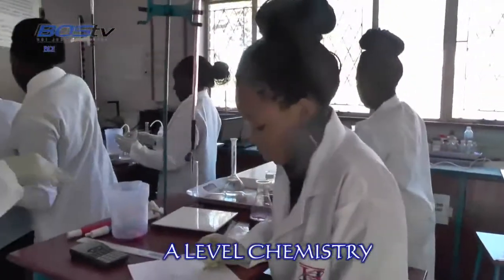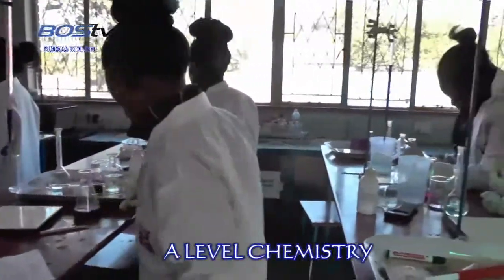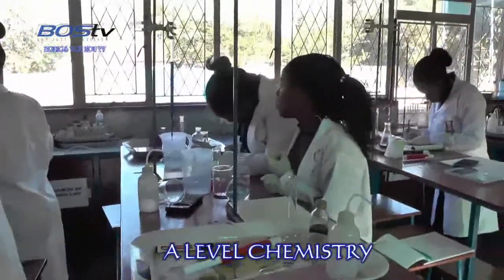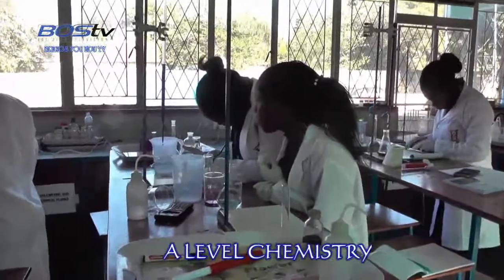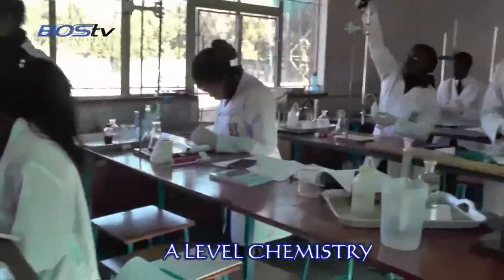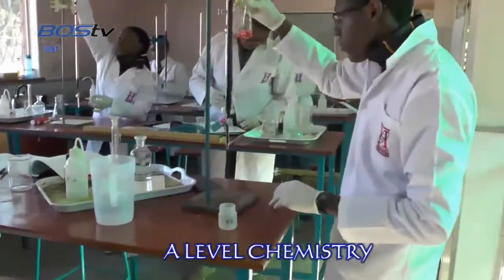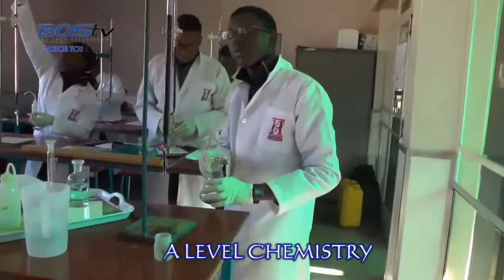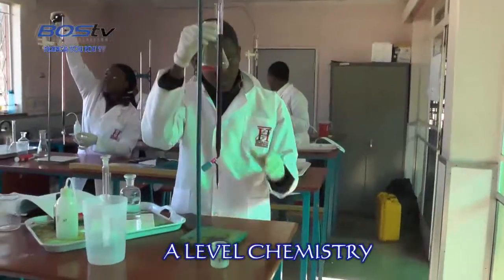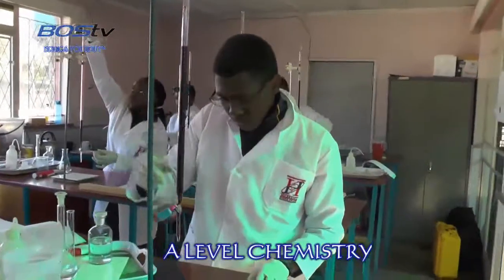Okay. Start controlling it around 30. Let's see, are you making progress? What's your rough titre? Now 3 more accurate titres.